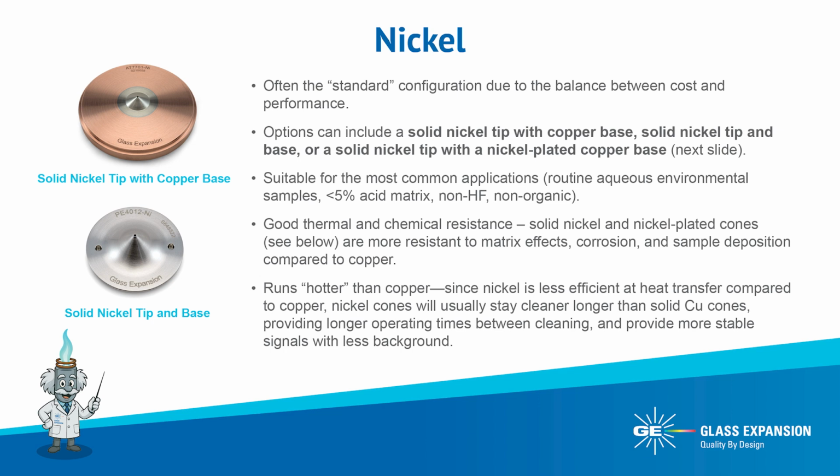Nickel is suitable for most common ICP-MS applications, including routine aqueous environmental samples with a total acid matrix of 5% or less. If your sample matrix contains any percentage of hydrofluoric acid or volatile organic solvents, you should not use nickel cones. A nickel tip with a copper base offers good thermal and chemical resistance. However, the solid nickel and nickel-plated cones have the additional advantage of being more resistant to matrix effects, corrosion, and sample deposition compared to those with a solid copper base.